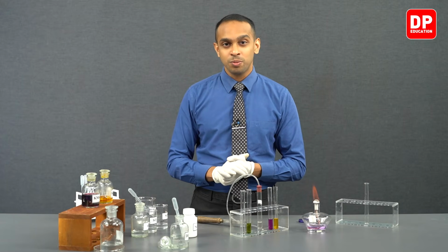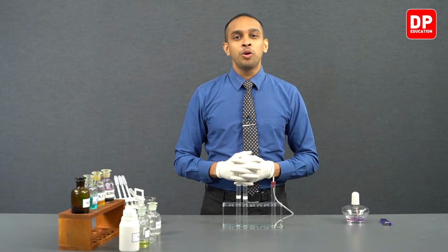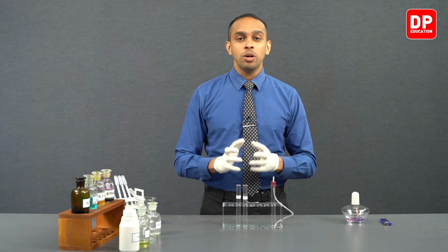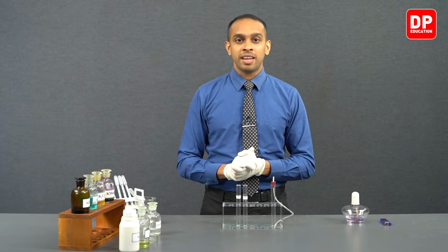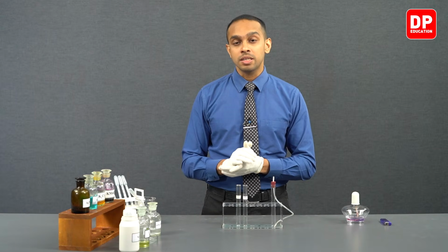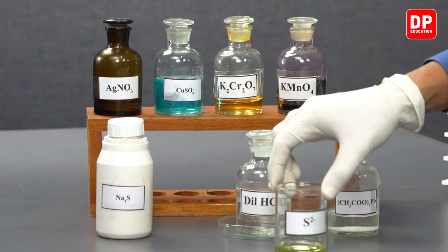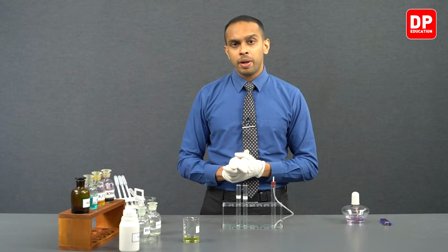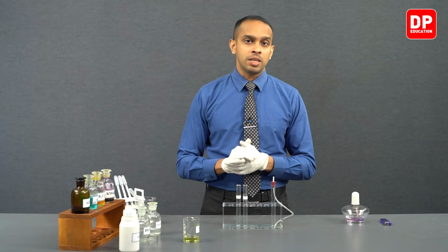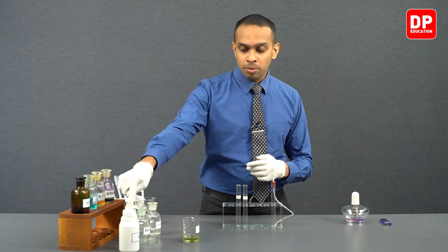Now, let's move on to the next part of this experiment. Now, we will be taking a look at how sulfide ions can be identified with different reactions. So, first, we are going to take our sulfide ion solution. We have prepared this sulfide aqueous ion solution with the use of sodium sulfide.